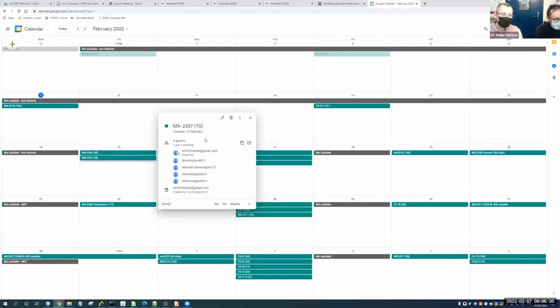Just to add to that, in terms of the day that you book, we always do our best to collect on that day, but we try to do it within three working beam days of that date. So it can be later or earlier as well. If your crystals are ready in advance, please feel free to send them, because we can always run them earlier if we have a gap in the schedule or someone else's samples haven't arrived yet.